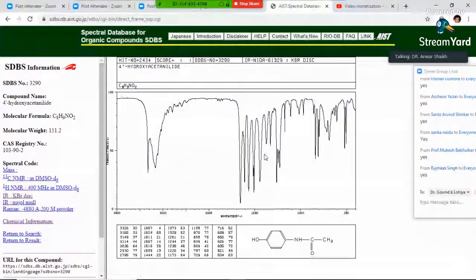Can you see the spectra of paracetamol here, all of you? Yes. Okay, I will repeat it. In this spectra, if you draw a line from 3000, you will get here a very small shoulder peak. This peak, can you see it? Very small, a shoulder peak. It is the 2900 peak due to this sp3 CH. As I told you, sp3 CH.